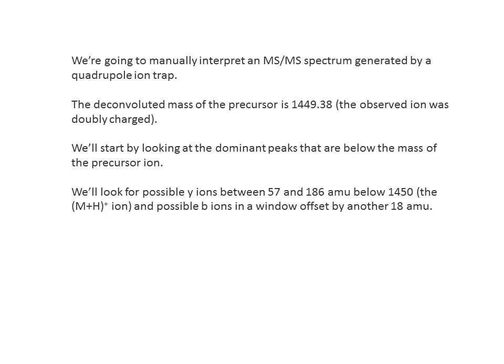So now we're going to work our way through an example developed by Karen Jonscher and published by Proteome Software, where you can find other resources about MS/MS sequencing and database searching.